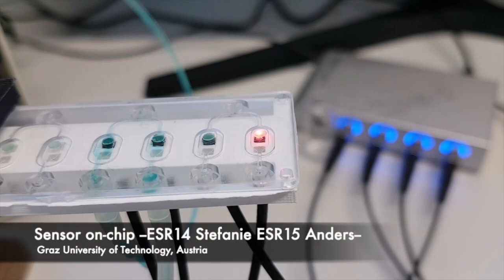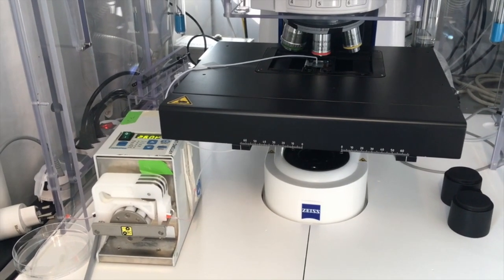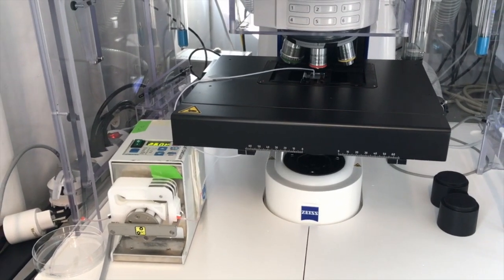When the cells are inside the chip, we need to know if they feel at home, if they are doing well. For that we use sensors to monitor how the cells are doing. After the chips have been made and we know that the cells are happy in the new environment, the research can start.